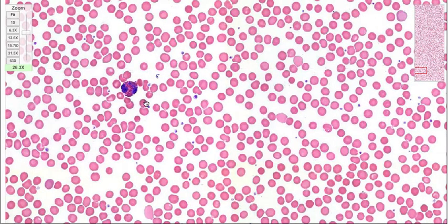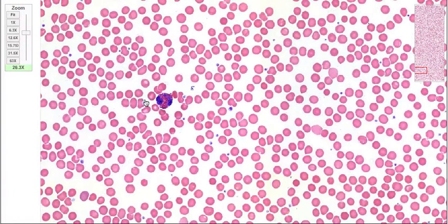What we're more interested in is this eosinophil. Eosinophilic means acid-loving, so they tend to be a little bit darker in their stain, as you can see here, compared to the neutrophil we saw before. So that's how they get their name. They're the second member of the polymorphonuclear family.